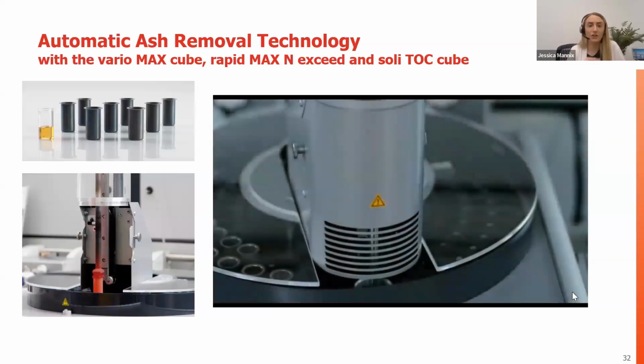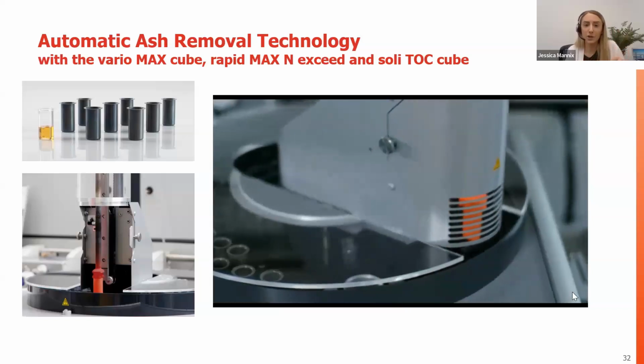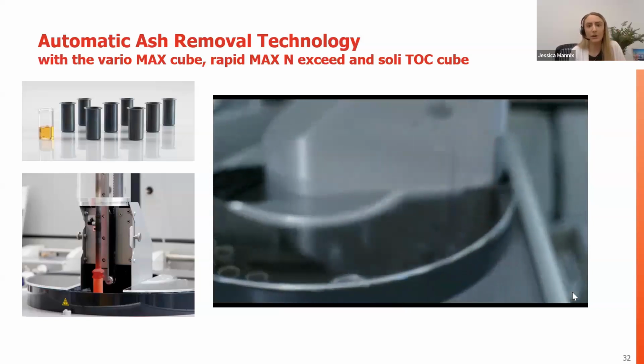And so just like our oxygen lance, right, that ceramic tube, I said that's dosing oxygen in the combustion chamber. For our microanalyzers on our macroanalyzer side, the actual gripper arm has a hole in it where we can change the dosing of either carrier gas or oxygen.